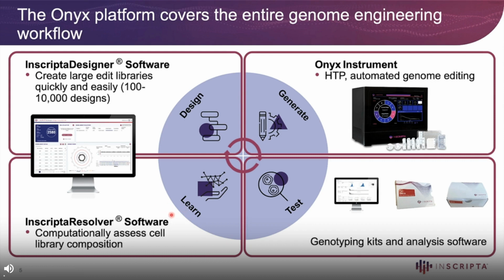And then with the learn phase, you would use the Inscripta resolver software to enter in all of your results from the genotyping kits and computationally assess your cell library composition.